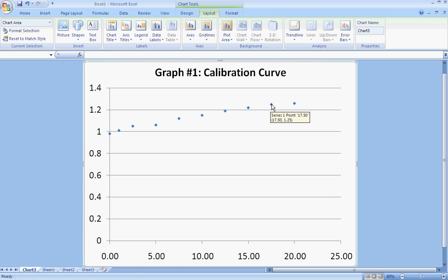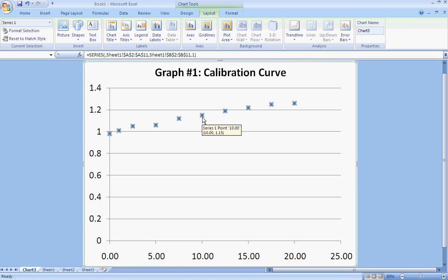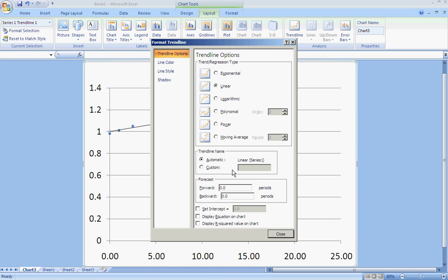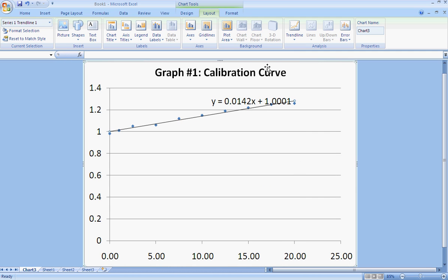And now I'm going to click on my data points themselves. So I just selected one of them. It doesn't matter which one I clicked on. I'm going to right-click on any of those and select Add Trendline. I want to add a linear trendline, which is already selected. But I also want the equation of that, so I'm going to click on the bottom, Display Equation on Chart. And it has the equation of that trendline.